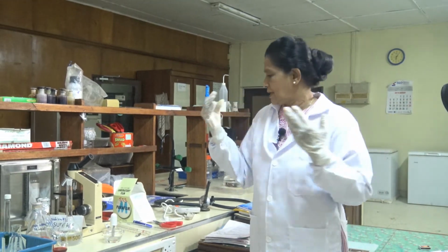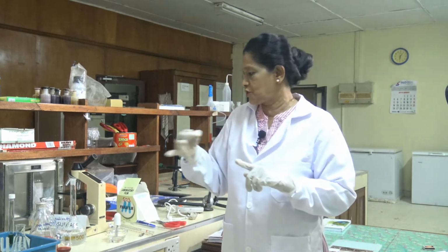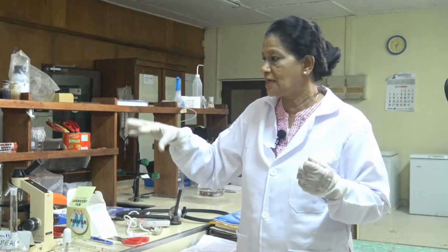When working with heat releasing equipments and burners, always remember to practice that no combustible material should be kept in the surrounding. Combustible material like paper, cotton, loose hair or loose clothing should be kept away from heating sources and burners.